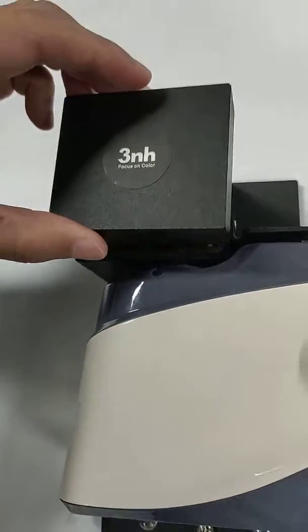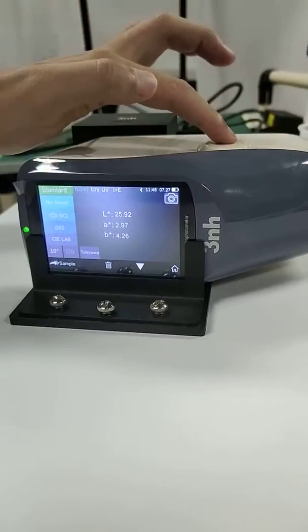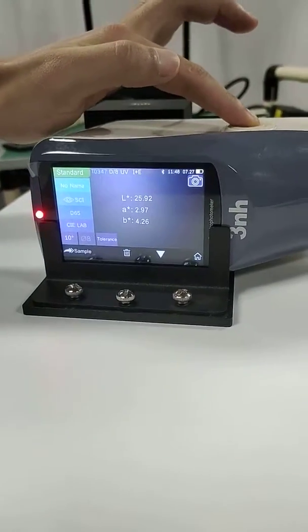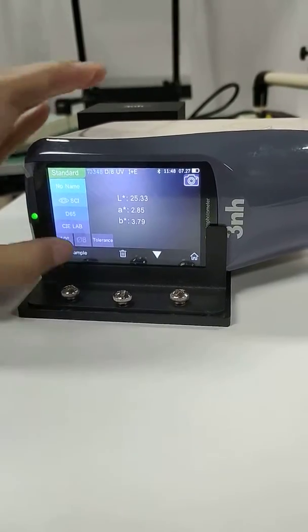Cover it. Press the measuring button. This is the test result.